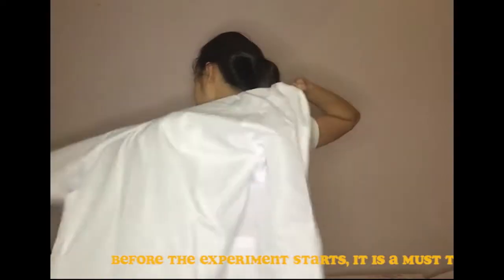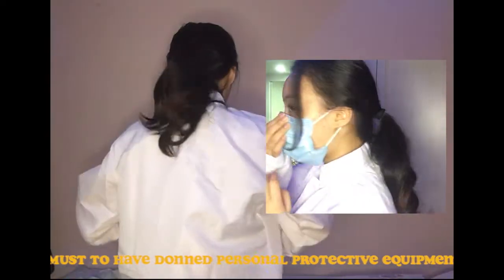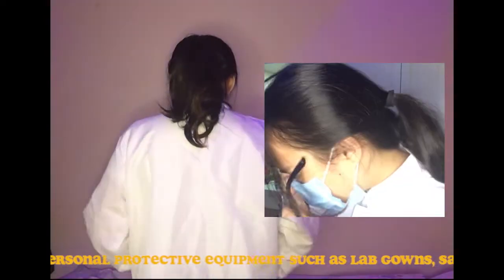Before the experiment starts, it is a must to have donned personal protective equipment such as lab gowns, safety goggles, masks, and surgical gloves.